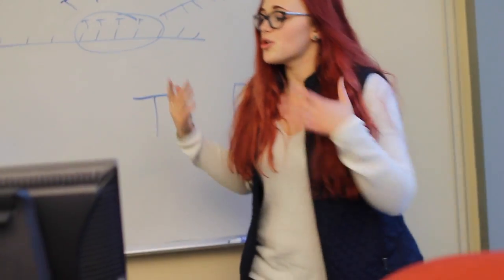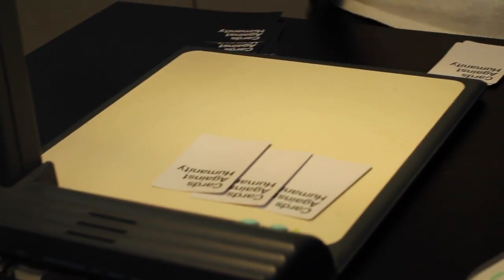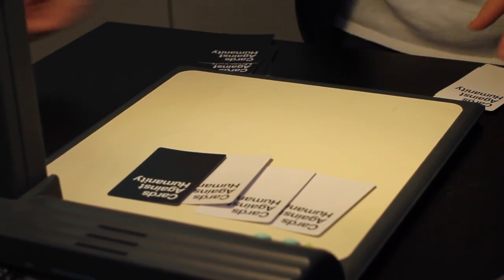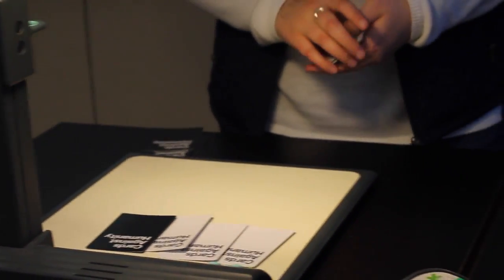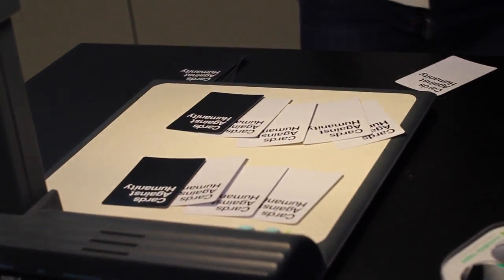So what happens with the polymerase is it goes along, and it'll put down a normal base, and a normal base, and a normal base, and then it just randomly grabs a bad base, and once the bad base is on there, if a normal base tries to bond again, it'll get kicked off and it won't be able to bind. And this does this randomly about the number of bases. So you can have 3 bases before a bad base, you could have 4, just like that. And then it's this difference in numbers of bases that gives the DNA sequence.